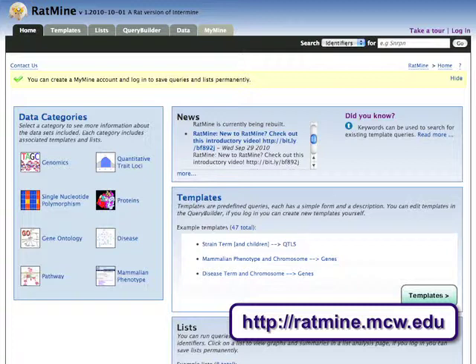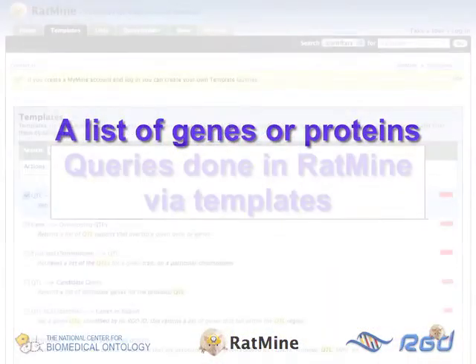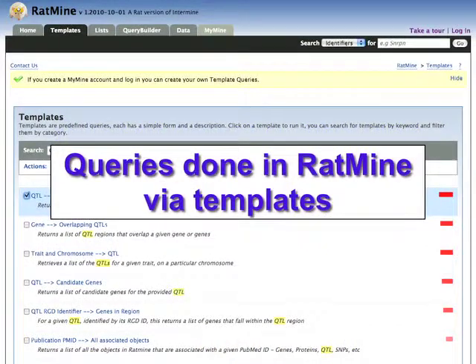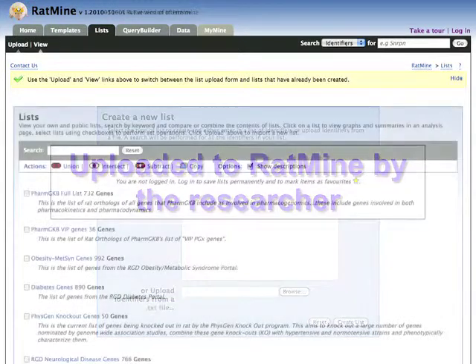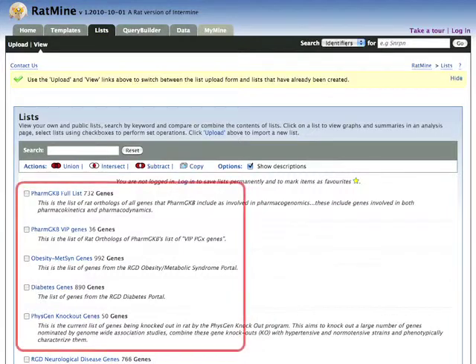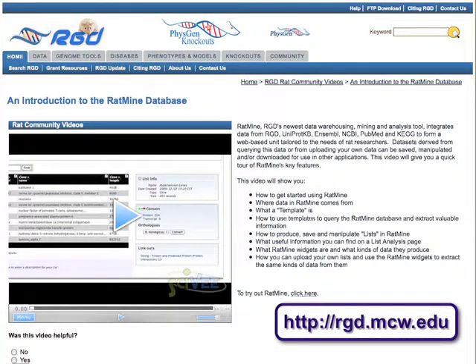Ontology enrichment analyses in RatMine begin with a list of genes or proteins. These can come from queries done in the RatMine tool via the templates, or they can be uploaded to RatMine by the researcher. RatMine also has a number of useful lists already saved and available for use. For information about RatMine in general, check out the Introduction to the RatMine Database video on the RGD website at rgd.mcw.edu.